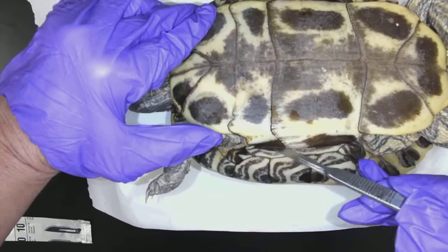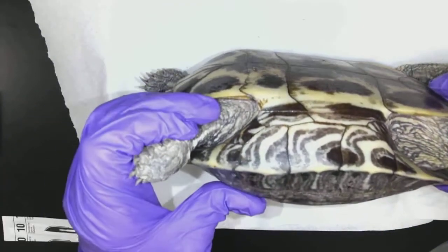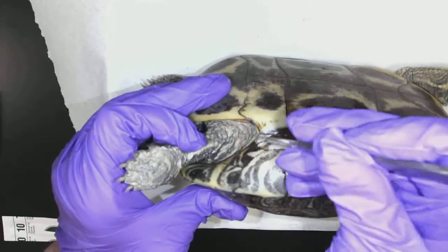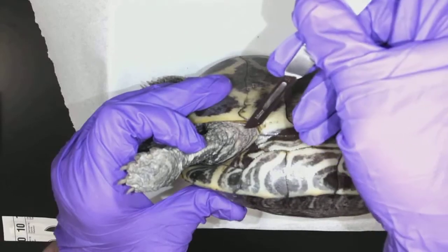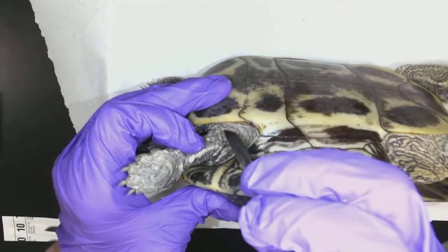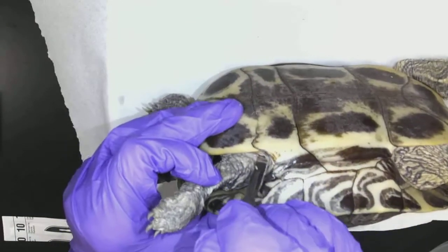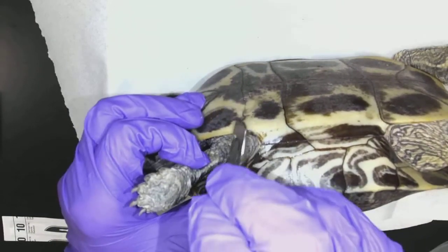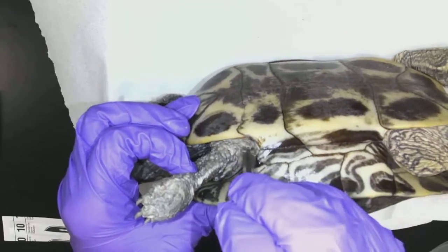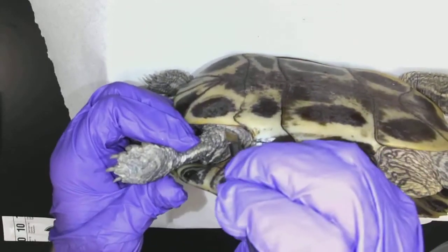So I got two saw cuts. Now I have to remove the plastron. We can see that the skin — this is a reptile — so reptile skin is very tough. I don't want to cut into the animal because I want to see what's inside. So if I use my scalpel and cut along, see how my blade's going along with the plastron? That will damage the fewest internal organs and just get the tissues.